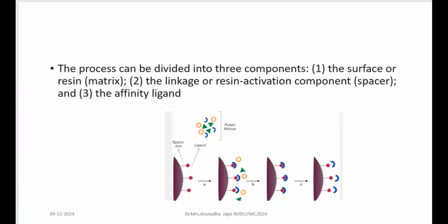But if I take horizontal arms away from it, so the stand has the vertical rod, and from the vertical rod you have horizontal rods extending, which act as arms with a hook. So you can attach multiple things onto it, and they will remain stable until they are removed, right? So when I'm talking about this spacer arm, why is it required? Very importantly, as I said, to hook your analyte selectively onto the ligand, it is required.